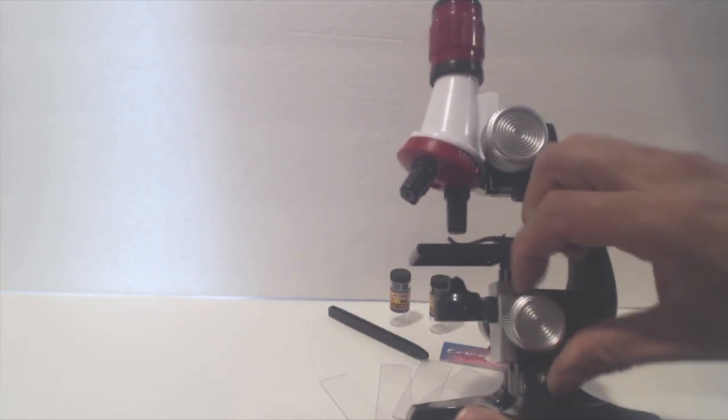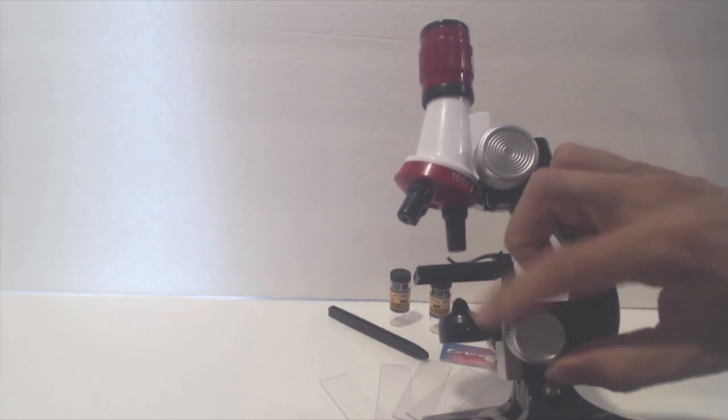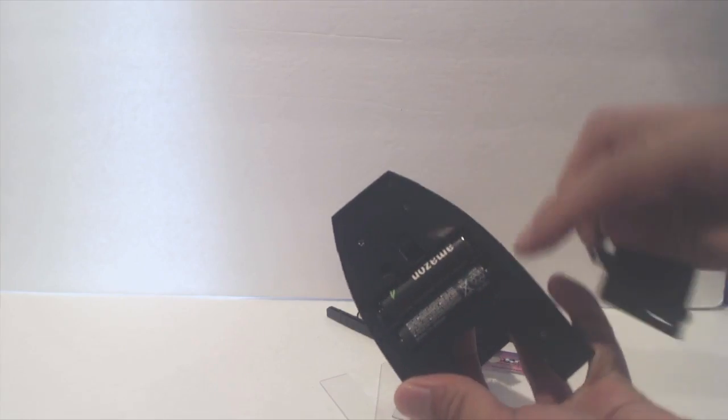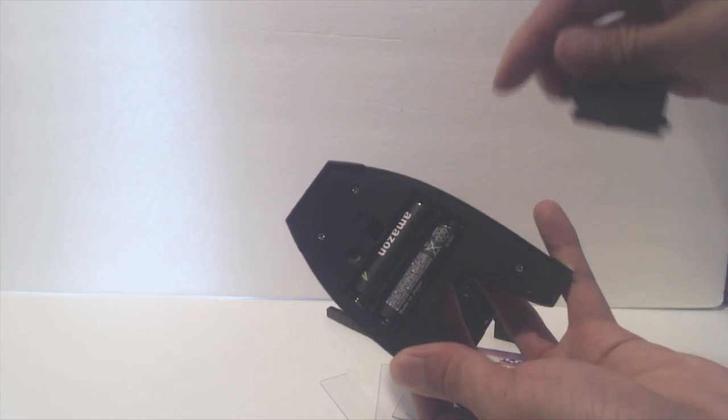To move the light higher and lower and adjust its intensity, scroll the small knob near the bottom. This microscope requires two AA batteries, which are not included, to power the LED light.